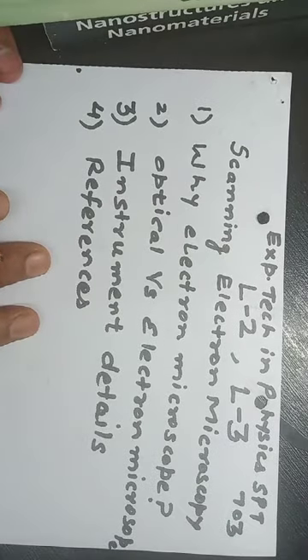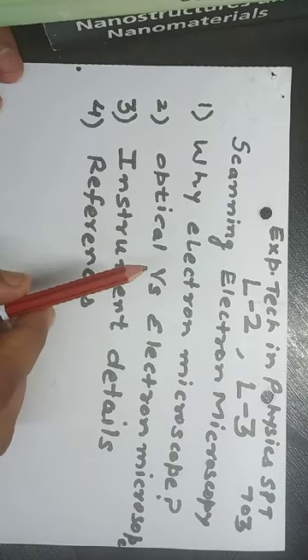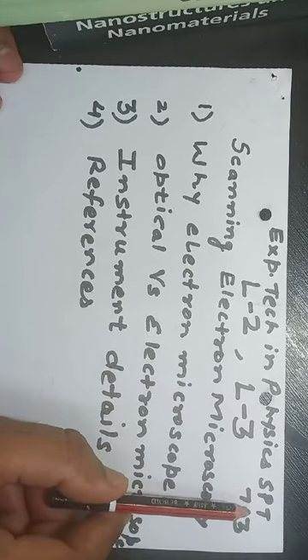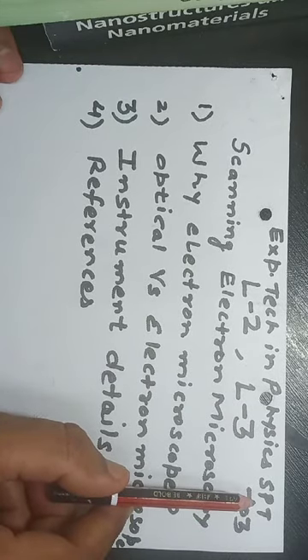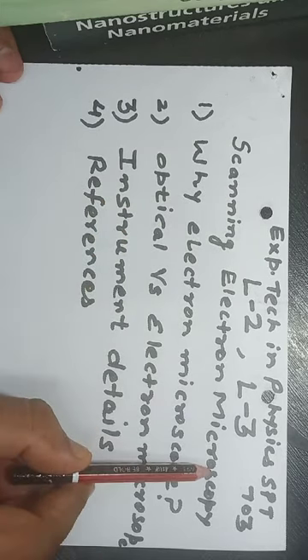Dear students, I am Dr. Rajesh Sharma, and we have started with lecture 1. In lecture 1, we discussed the details of the syllabus for Experimental Techniques in Physics, SPT-703. Now, in the second lecture, we would like to come to scanning electron microscopy.